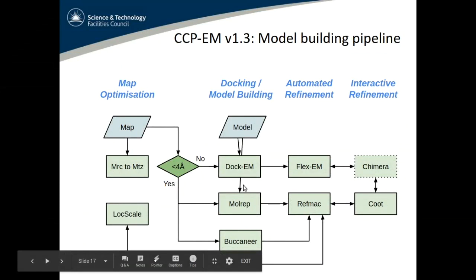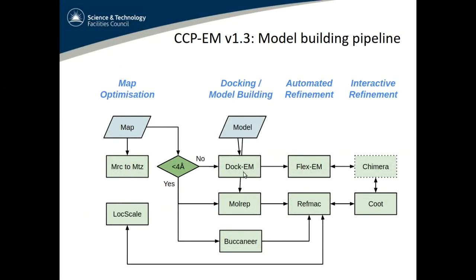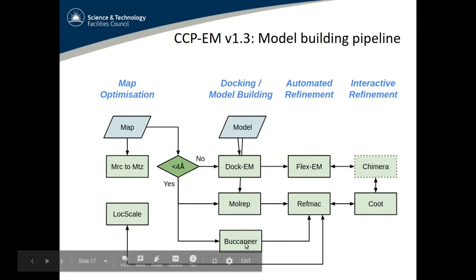We then have tools for docking or model building. So if you've got an initial model, you can start with either DockEM at lower resolutions or MOLREP at higher resolutions to do your rigid body fitting or docking. If you don't have a model, you can use Buccaneer to do a de novo build. I'll show you a bit more about that later on.